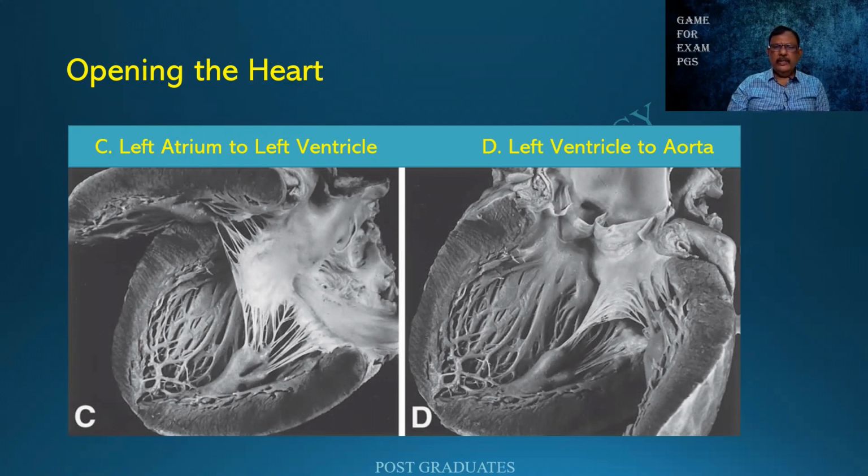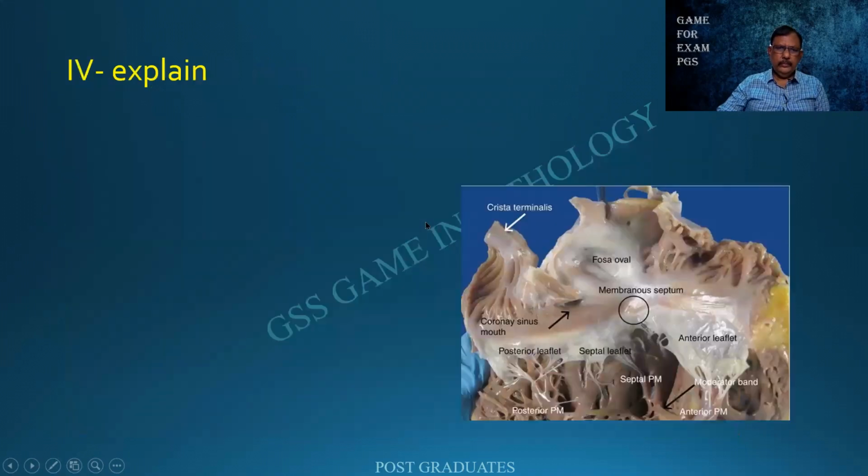The direction of flow of blood. And who said this? It is Rudolf Virchow, the father of pathology. And when we do all this, we'll be able to see multiple structures. As I mentioned earlier, there can be a fossa ovalis, which can be a remnant. There can be a membranous septum, which grows into a complete septum.